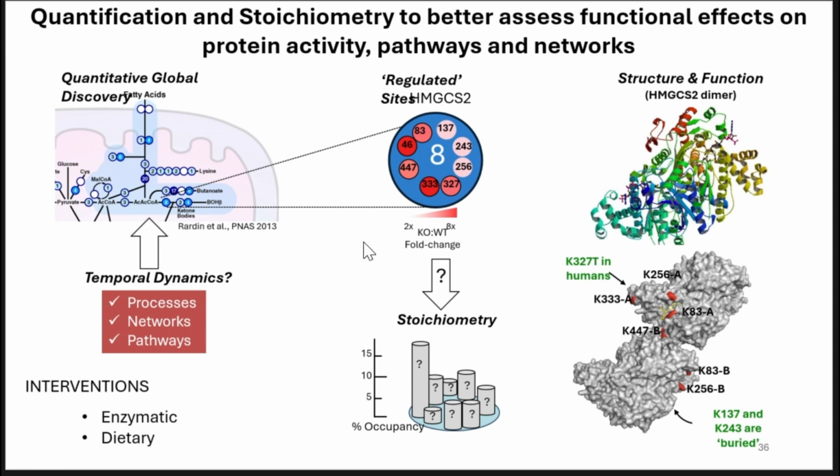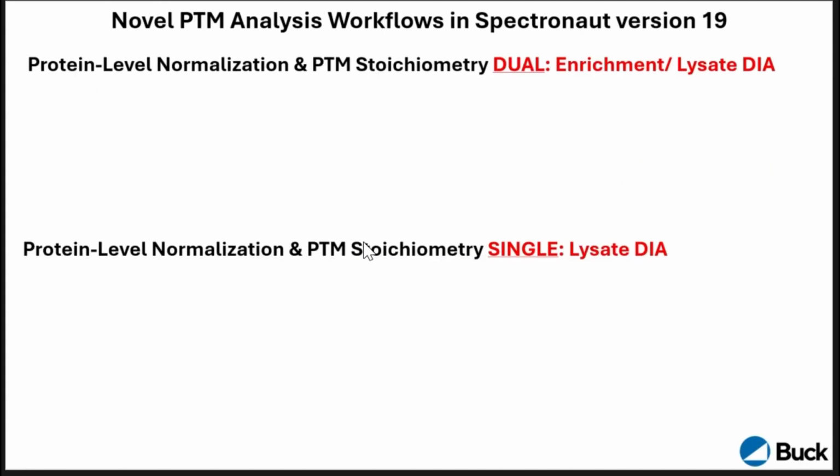So Spectronaut has these stoichiometry workflows now, and for us this has become really important and is included in all the reports, and you can customize the reports. I will show you in one of the next few slides. So today I wanted to show you two different ways you can use Spectronaut for PTM work.